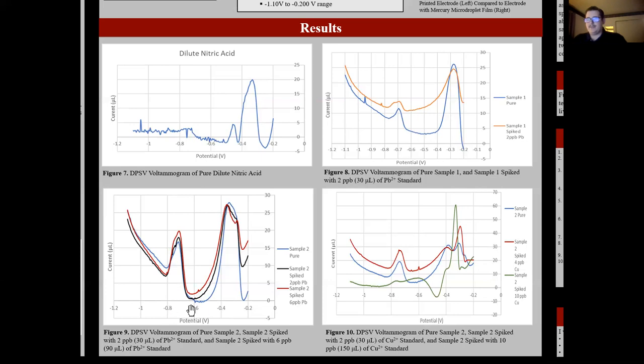You can see another peak in figure nine at about the same place. This is for sample two, and you can again see that it is being spiked with two parts per billion, and then another four parts per billion for a total of six parts per billion of lead standard. You can see this peak growing, showing an increase in lead concentration.